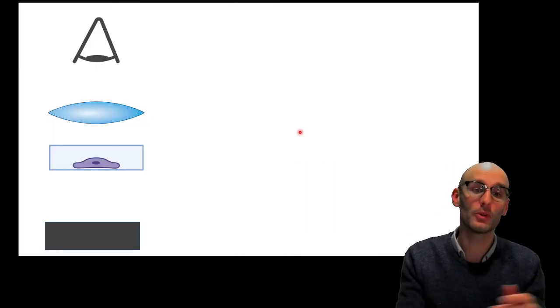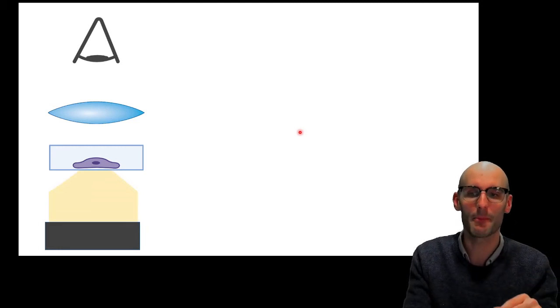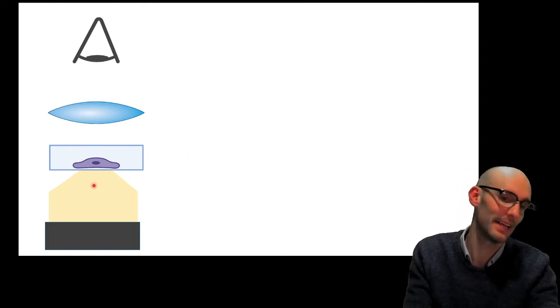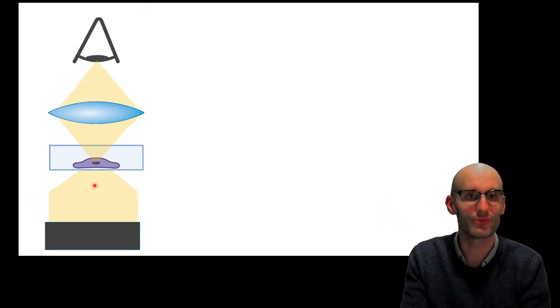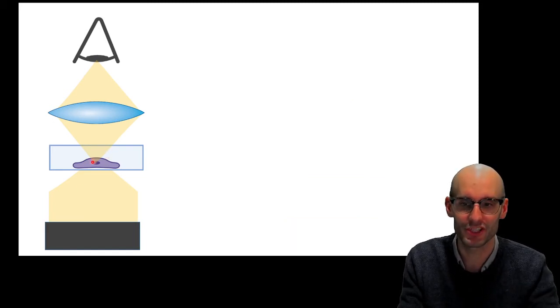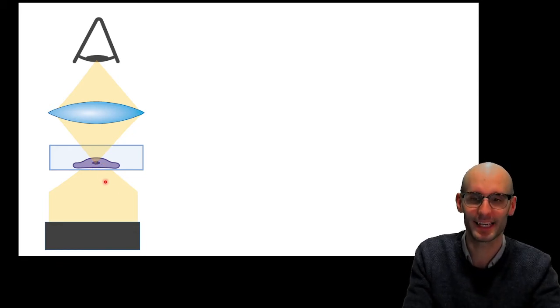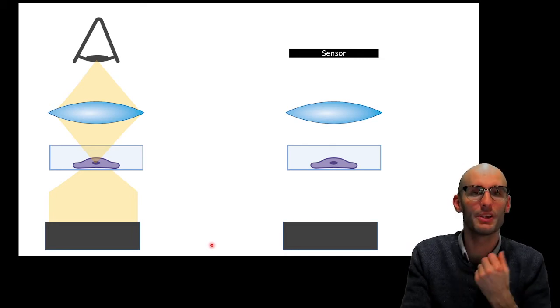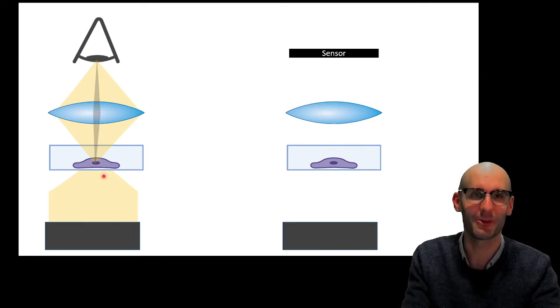So how does it work? Well, let's first look at a light microscope, just a quick refresher, and then jump into an electron microscope. So a light microscope, we focus the light with a lens called a condenser. It hits the cell, for example, that then is scattered out to a lens. The lens then redirects the light back into our eye, and part of it might cast a shadow like the nucleus there. And so we would see the nucleus from casting a shadow. So now let's look at an electron microscope. It's set up very similarly. We shoot an electron beam. Oh, sorry, there's the shadow. I wonder where that was going to pop up. That's the shadow of the nucleus there.